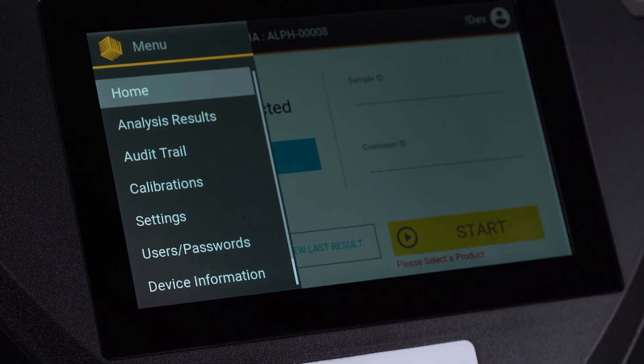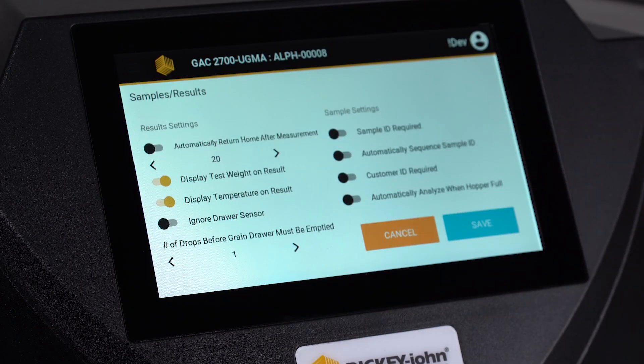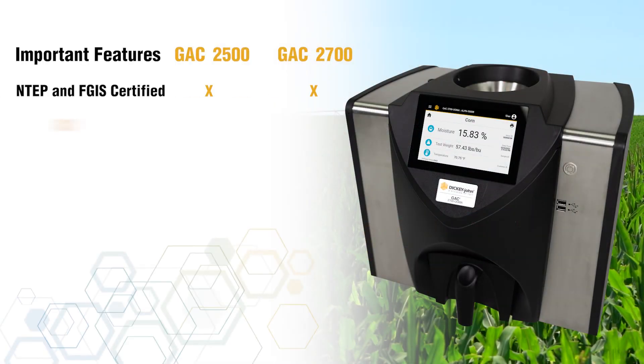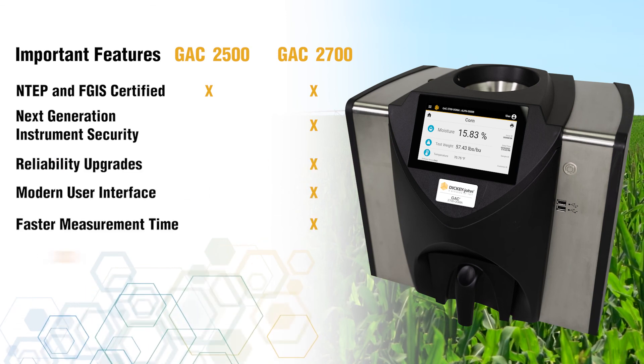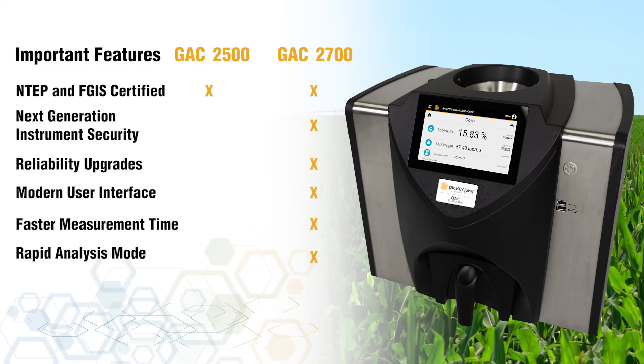The new user interface is intuitive and user-friendly, which can reduce the training time of new and seasonal employees. The GAC 2700 Grain Moisture Analyzer uses the same technology and metrology as the GAC 2500 model to deliver the most accurate measurements available with dielectric grain moisture meters.